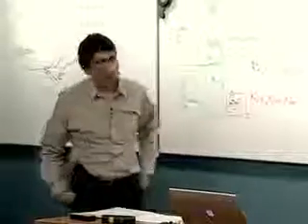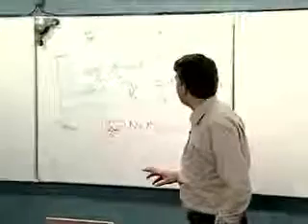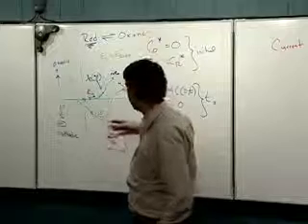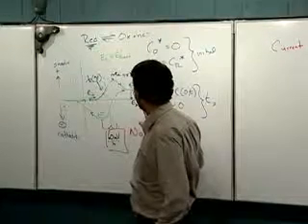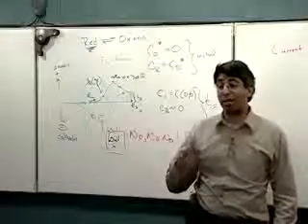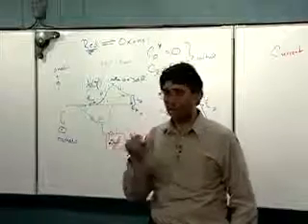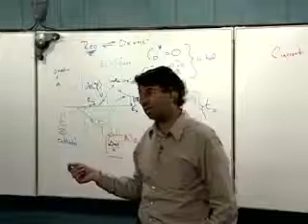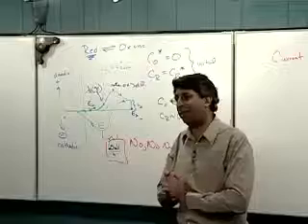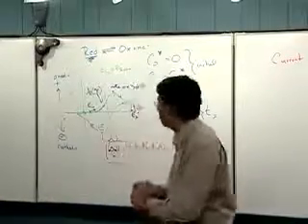Okay, so we have the cyclic voltammogram, and the issue that we have to deal with now is how to utilize the diagnostics, or how to actually use the diagnostics. And really, in addition, you need to have a large range of scan rates. Not necessarily a lot of separate cyclic voltammograms, not necessarily a lot of different scan rates, but a large range on the scan rates. Typically, a number like 5 would be a good number, but again, spread over at least 2 orders of magnitude, and preferably, if you can stand it, 3 orders of magnitude. So some number like that.